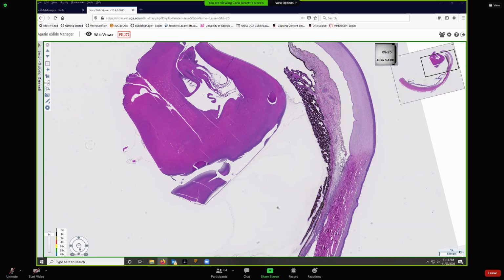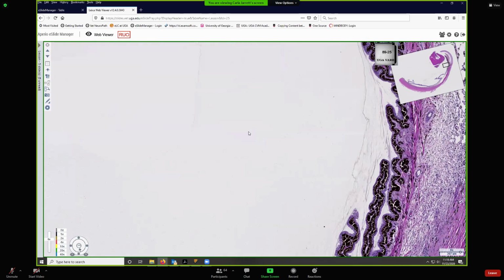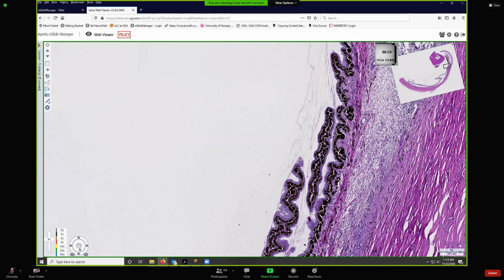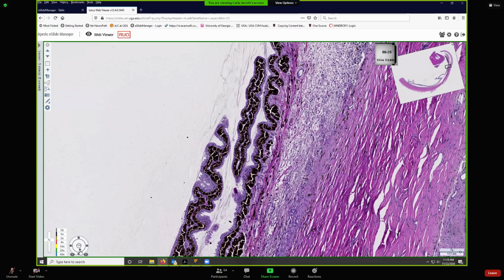And then to go along with that, there was a question about the zonular fibers, what they're attached to. You had an image to go with it so that you could decide what those zonular fibers are attached to. Here, I'll zoom in. Let me turn this a little bit.